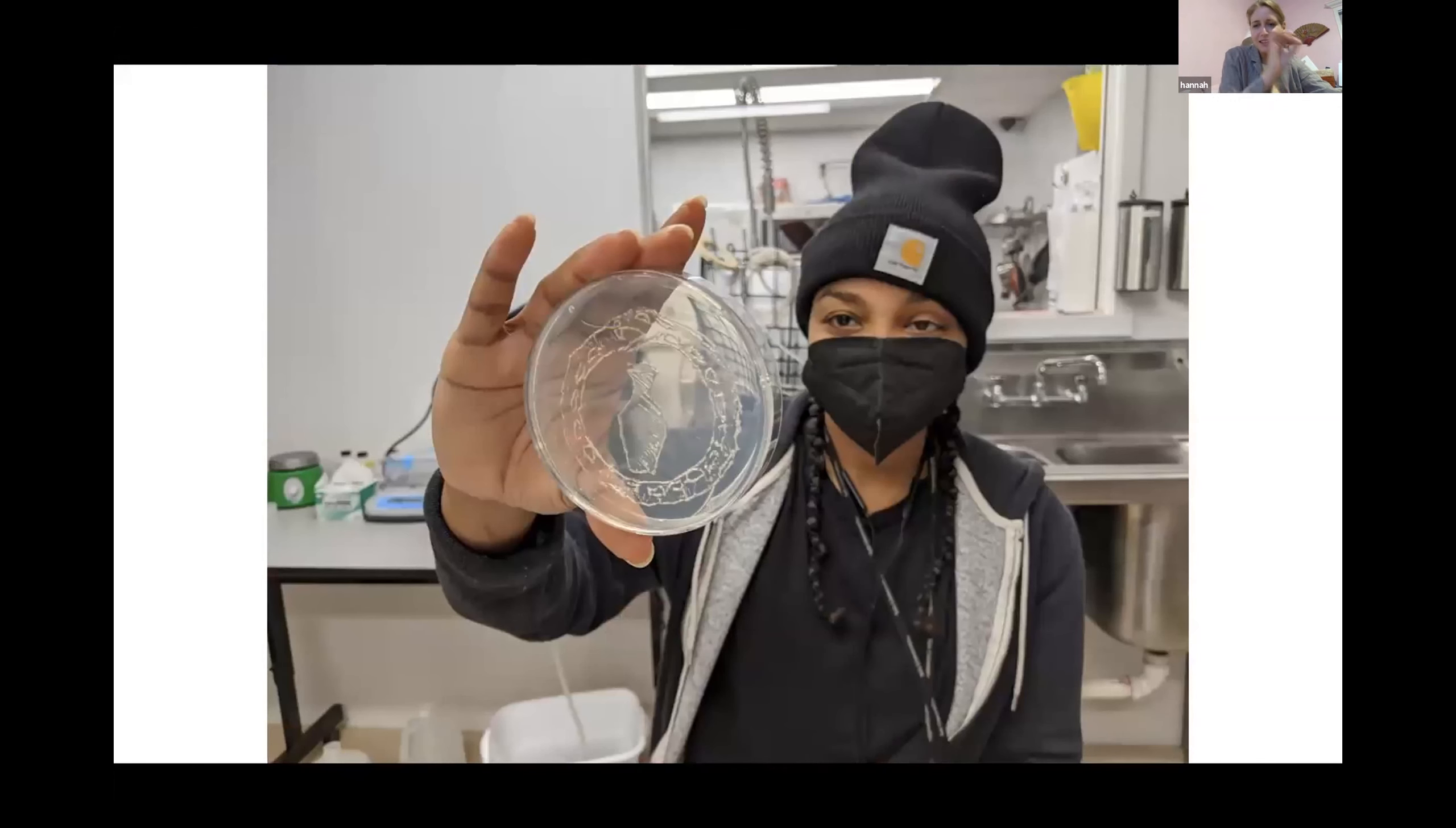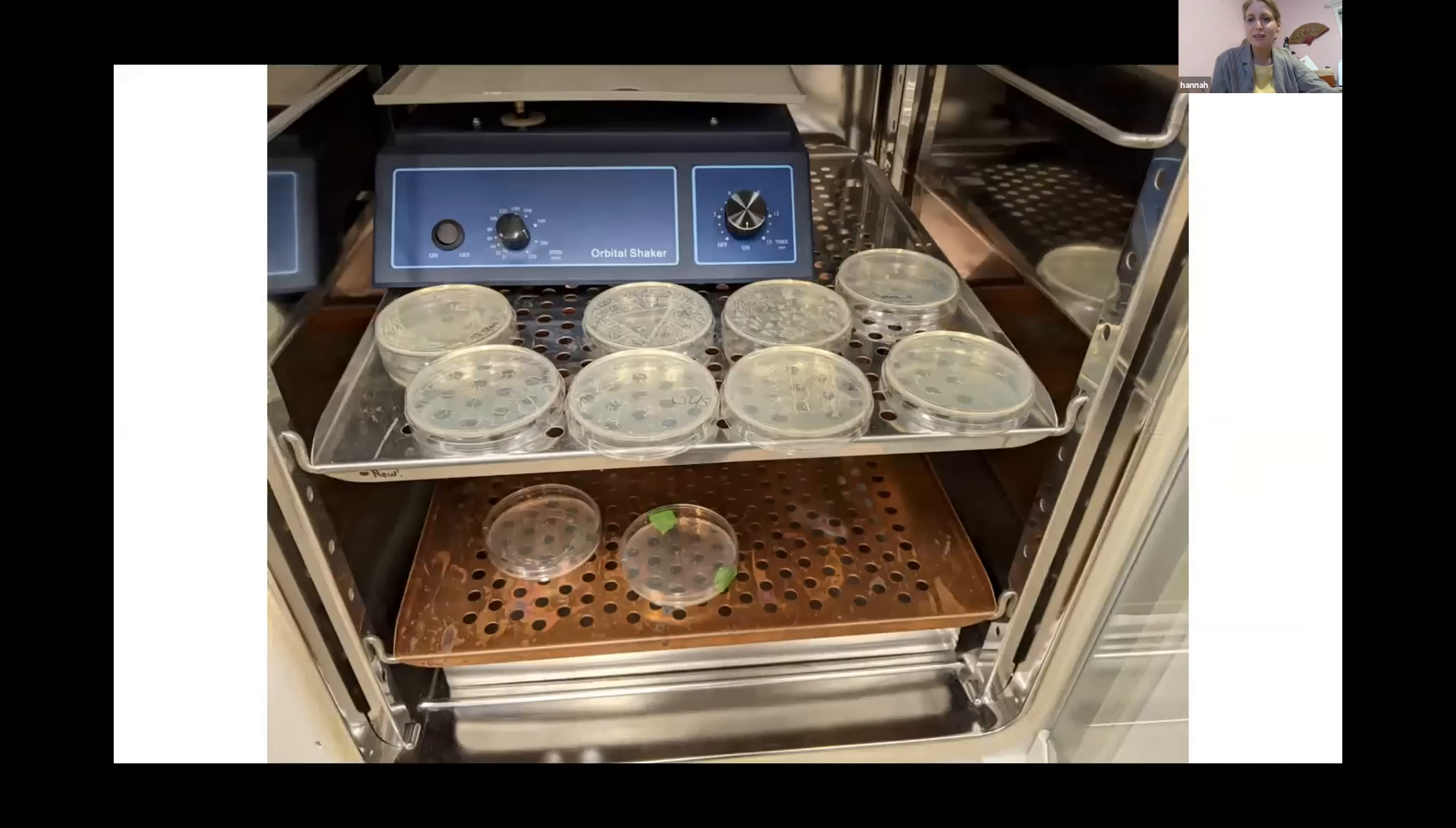And so then when people came in, we were able to draw pictures that we wanted to make with the bacteria and all the different colors. Everybody went around and traced and drew stuff using these different colors and kind of mixing things and spreading it around. And then you can kind of see the outline of what everybody made, but it hasn't quite filled in yet because what you need to do is take your art and then we put it in the incubator which lets the bacteria grow and this brings the picture to life and all the different colored bacteria can confirm an image.